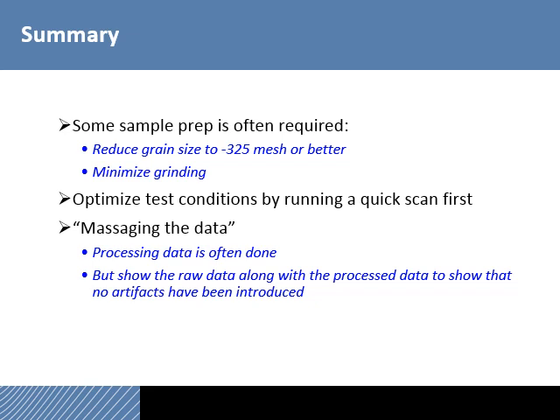As I said, I don't, but you may need to for submissions to papers and whatnot. But as the second bullet indicates, show the raw data along with the processed data to show that no artifacts have actually been introduced. So they can see the raw data and realize that you've just cleaned it up for presentation purposes. And that is the end of this module.